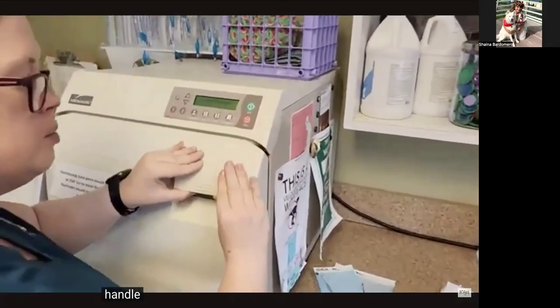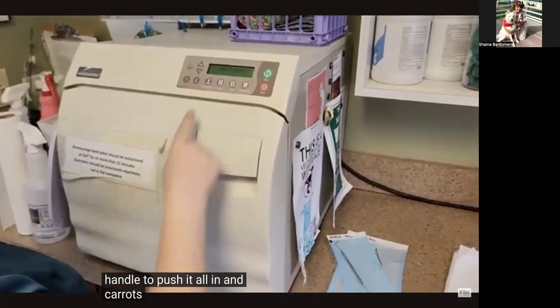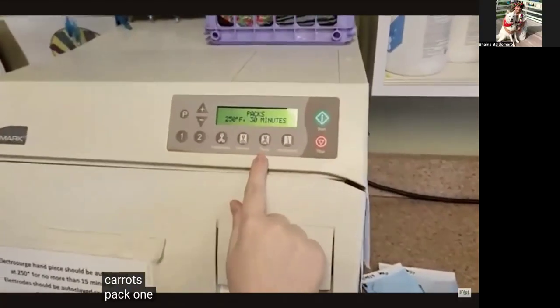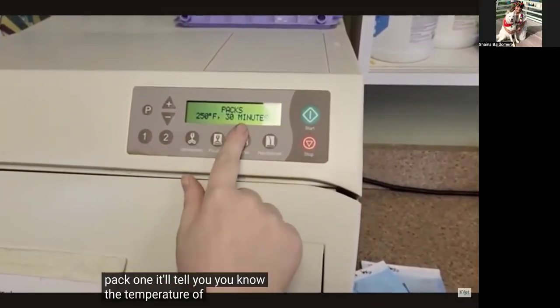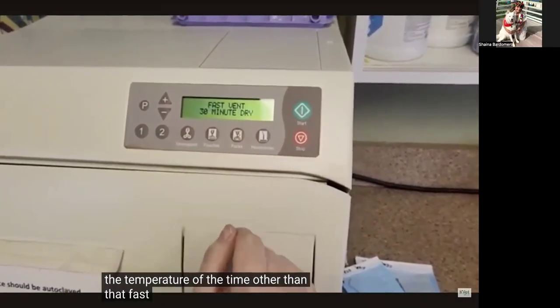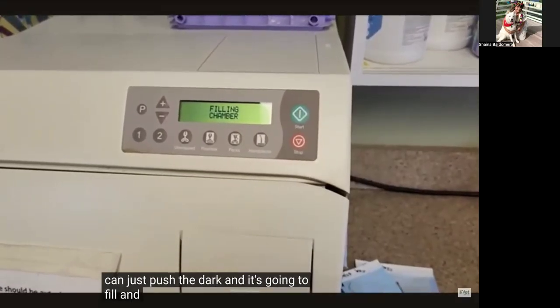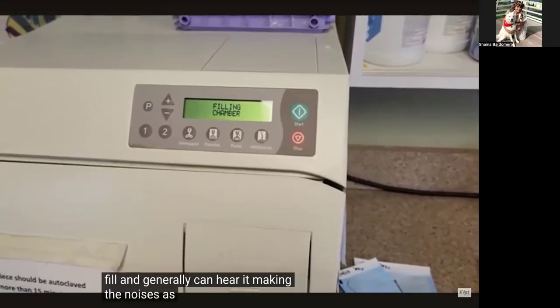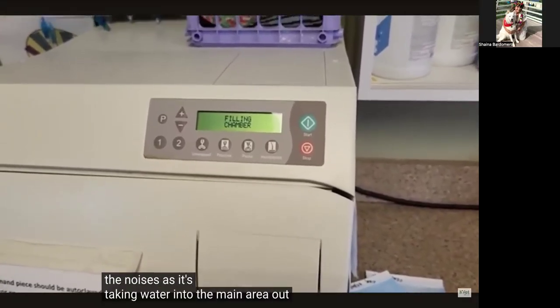Up on the handle to push it all the way in and down to secure it. Those are packs. So pack one, it'll tell you the temperature, the time, and then it fast spins for drying. And then you can just push start, and it's going to fill. You generally can hear it making the noises as it's taking water into the main area out of the tank.